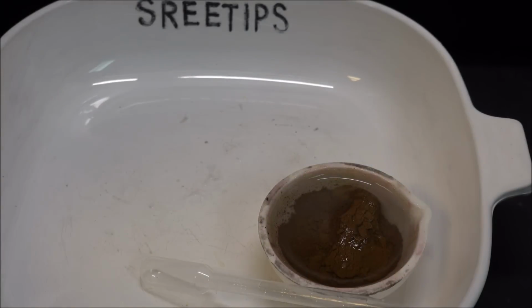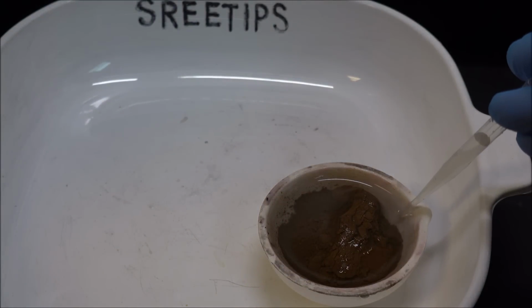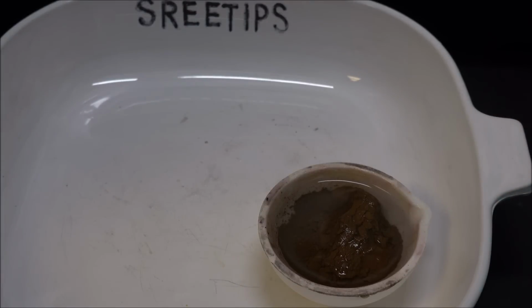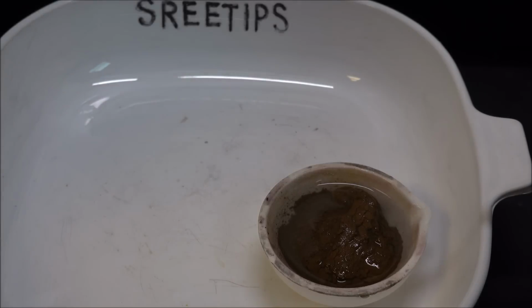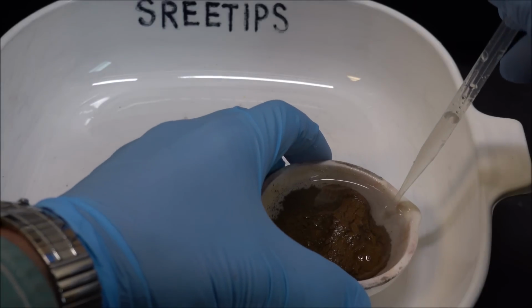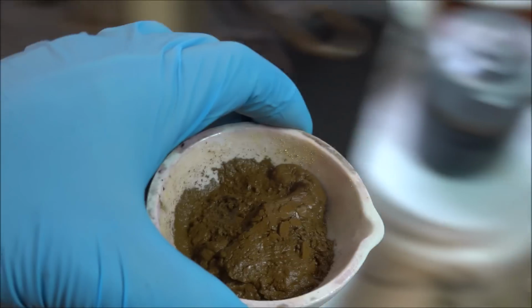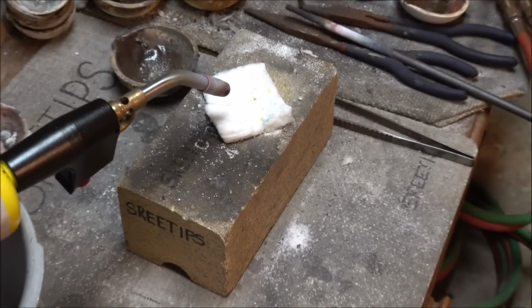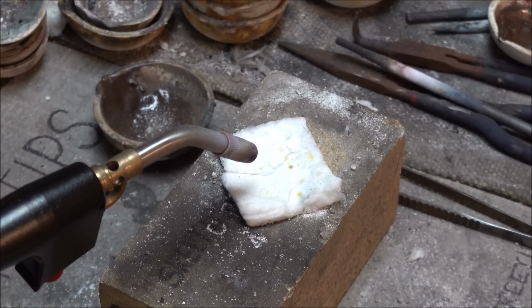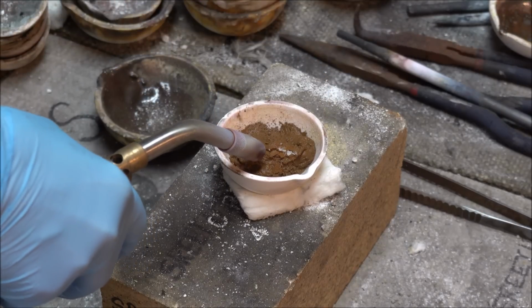Alright, now what I'll do is take this pipette and we'll draw off as much of this water as we can, add it to our waste container back here. Okay, I've got most of the water, the liquid drained off of there. Now we're going to go over here to the melt table, and what we'll do is get it down here underneath the torch and get this thing melted up into a button so we can get a yield on it. Here we go.